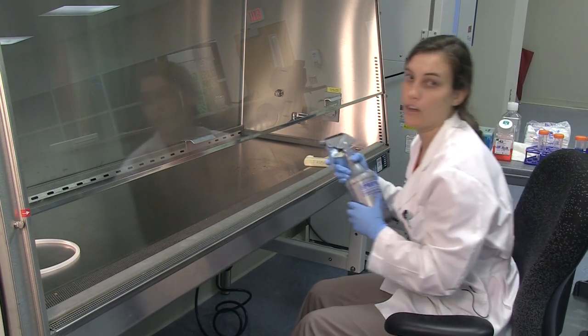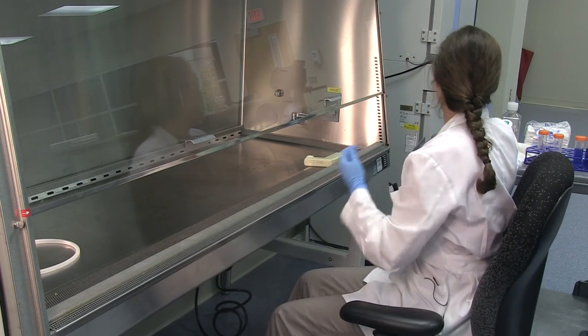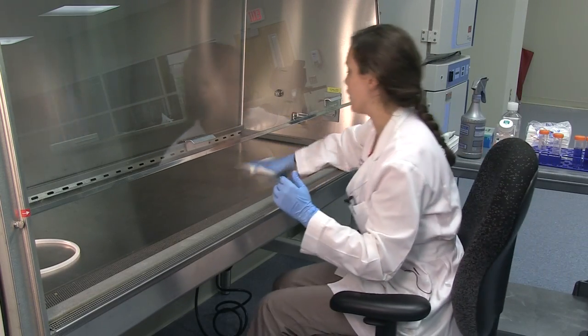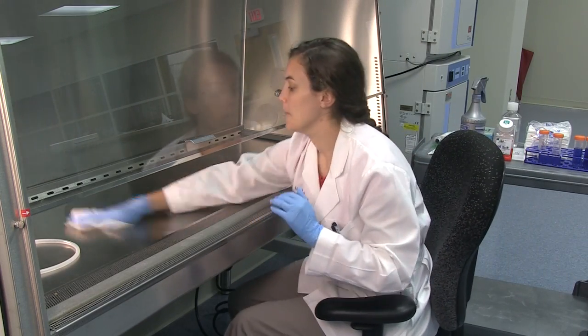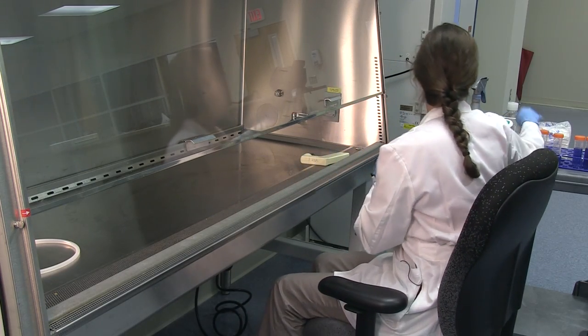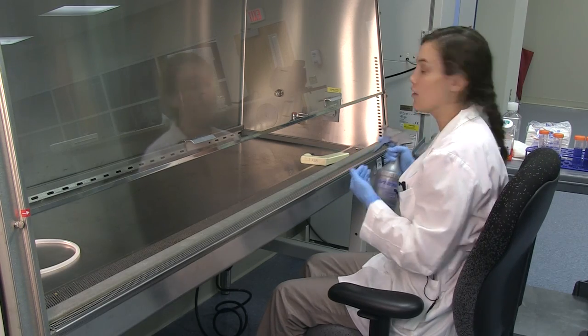Before working, you can spray the hood with 70% ethanol, and also your gloves as well. This will help further clean anything inside of the hood. Then everything going inside of the hood, you can spray off with 70% ethanol as well.